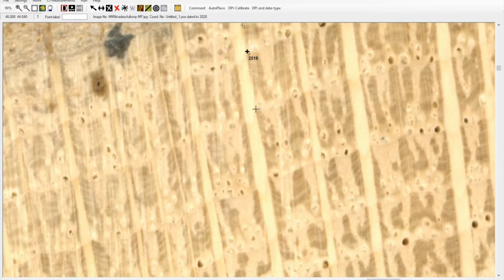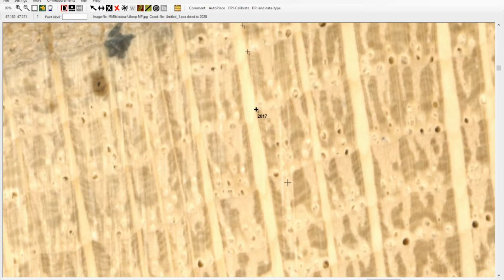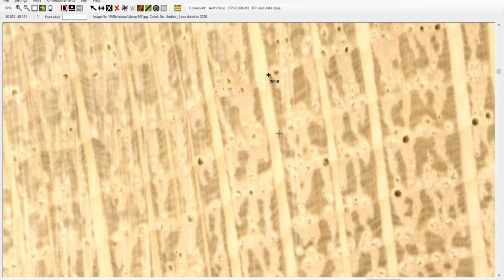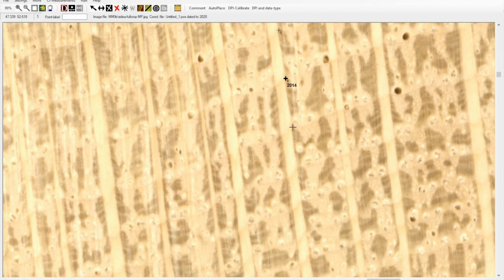We want to make sure that each selection is parallel to one another on the ray and the recorded distance of the true ring width, because if we end up jumping around and it's not parallel, then we're going to have inaccurate measurements. As you can imagine, if it goes sideways, then you're not going to get the same measurement. Rays will typically only last for a certain span of the sample, so we can switch to a different ray with the more than one point per selected line tool, and that allows us to move to another ray and select more points on that other ray.